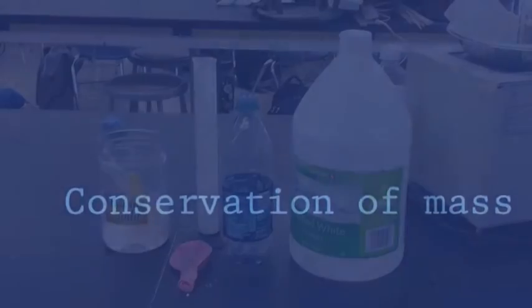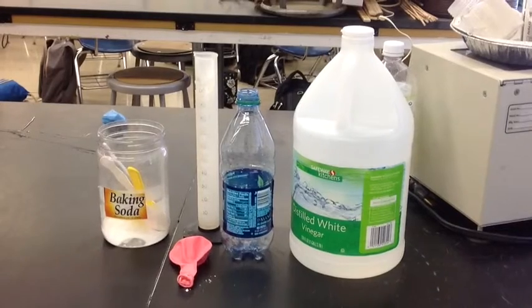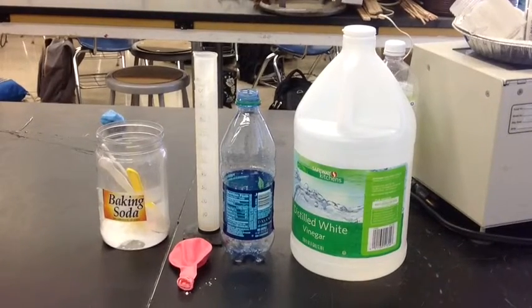Today I'm going to show you how to conduct the conservation of mass experiment. To conduct this experiment you will need a soda bottle, a balloon, baking soda, 50 milliliters of vinegar, a balance and graduate, and safety goggles.